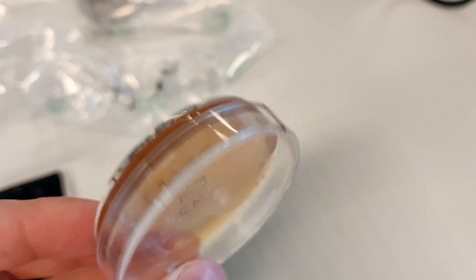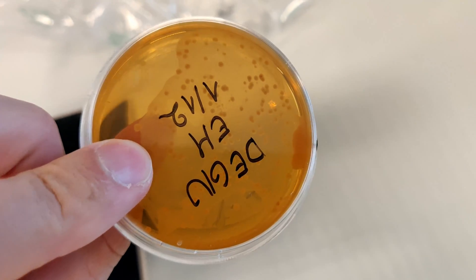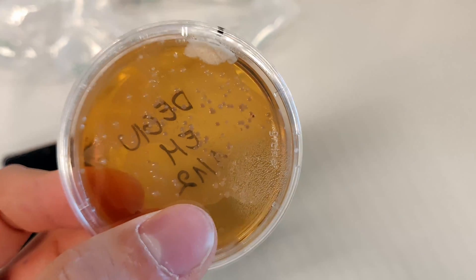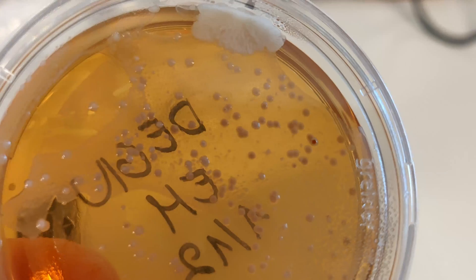How do we actually examine a world we can't see with the naked eye? In this video I am going to give an introduction in how I use standard culturing methods and PCR to identify bacteria.